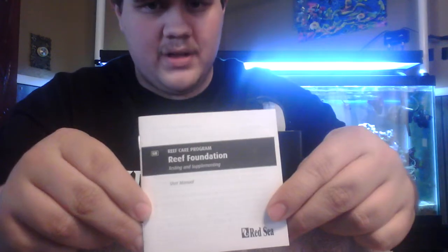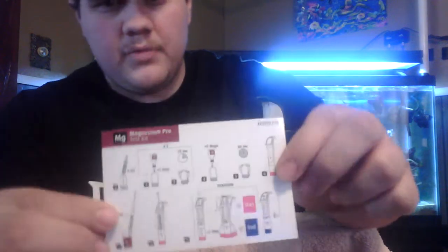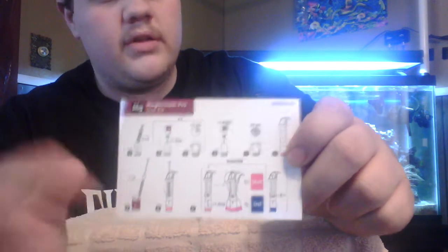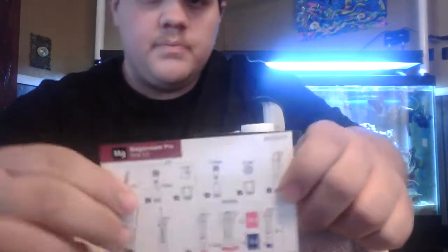We have a booklet that tells you how to do the test and all that good stuff. You also get this nice laminated card — so if it gets wet it's semi water resistant. It has quick instructions with pictures that tell you how to do the test, which are very easy to use. You don't have to worry about going through the pages of the little booklet. I love this part.